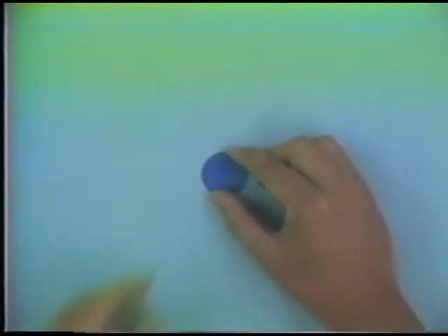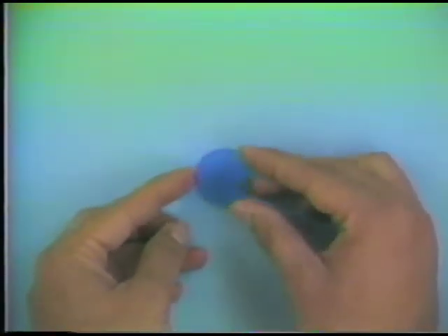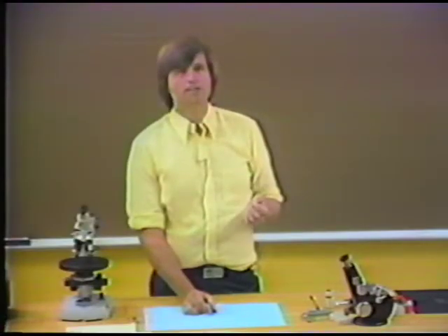And there's also a filter which is commonly used, and this we use because the light typically coming from a tungsten bulb is colored. It's somewhat yellow, and so we use a blue filter which corrects the light so that it is very close to white, or relatively balanced right across the spectrum, so that we have white light and we don't have a bias toward yellow wavelengths.